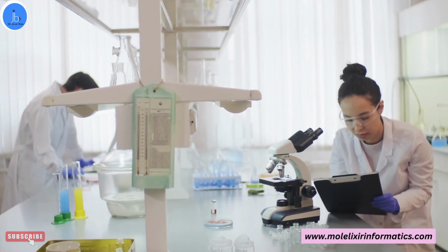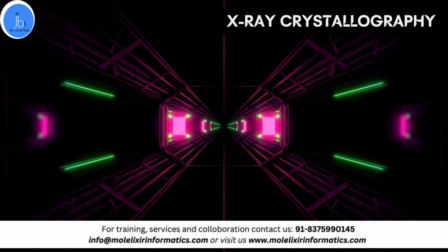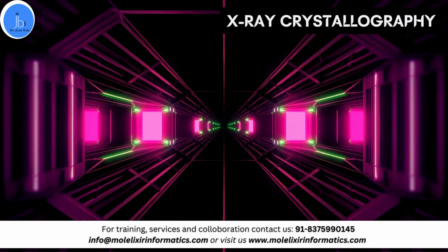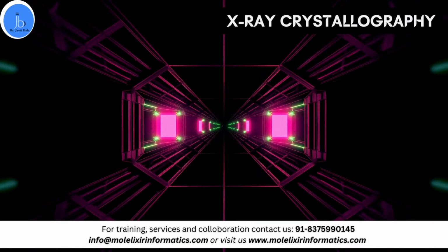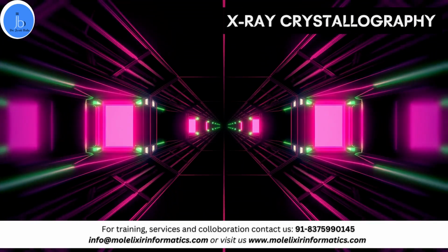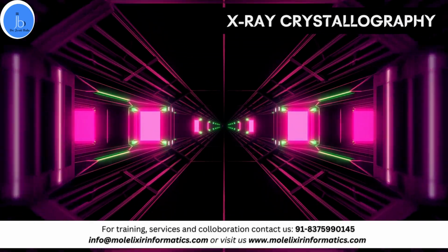Number one is X-ray crystallography. This determines the three-dimensional structure of biomolecules such as proteins and nucleic acids. X-ray crystallography crystallizes the biomolecule, exposes the crystal to X-rays, and analyzes the diffraction pattern to determine the electron density.